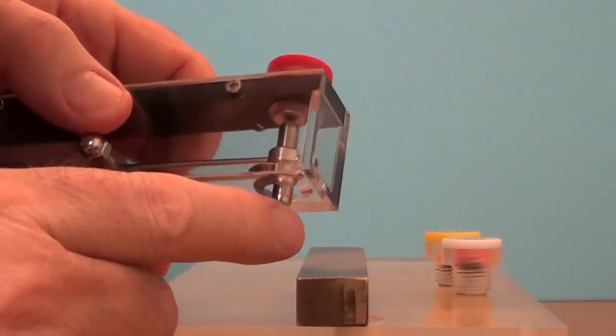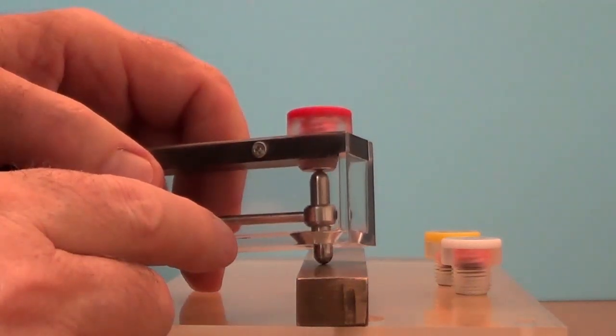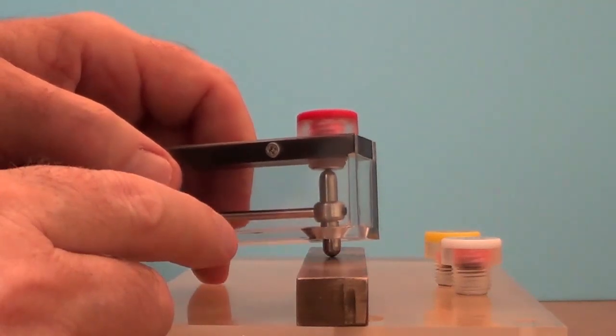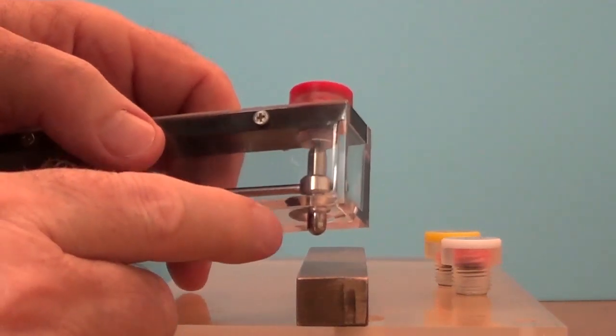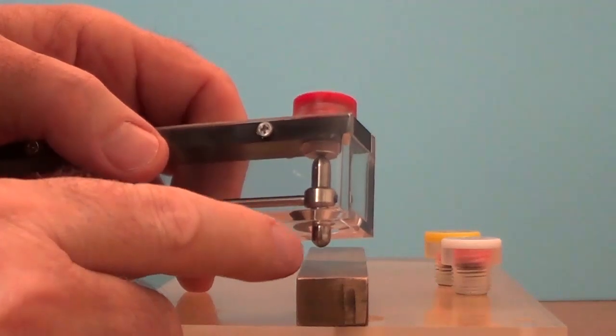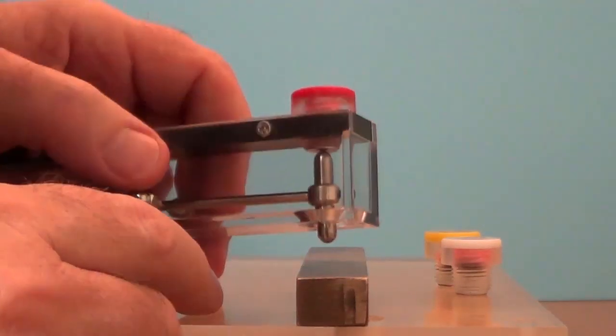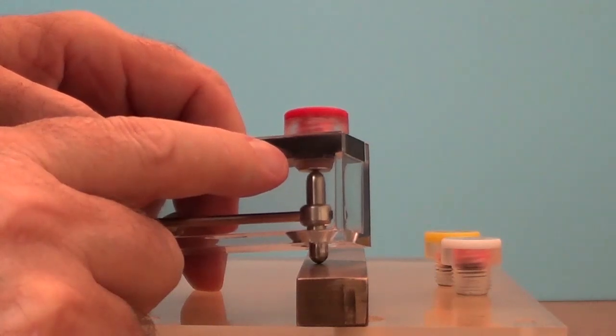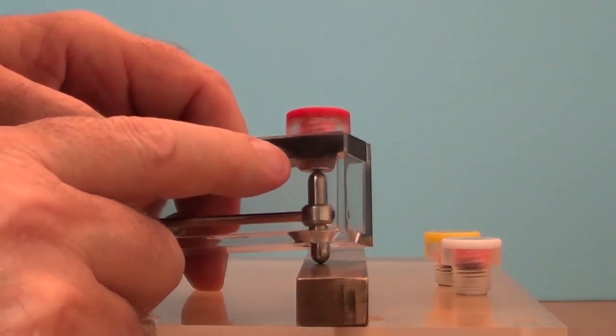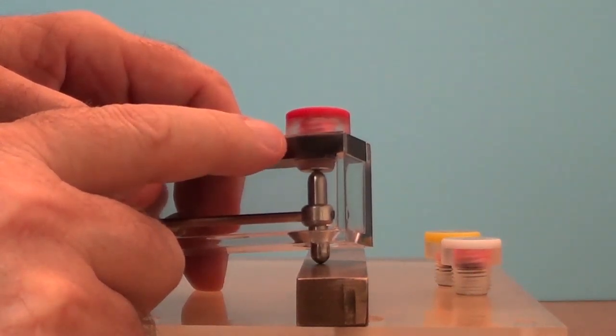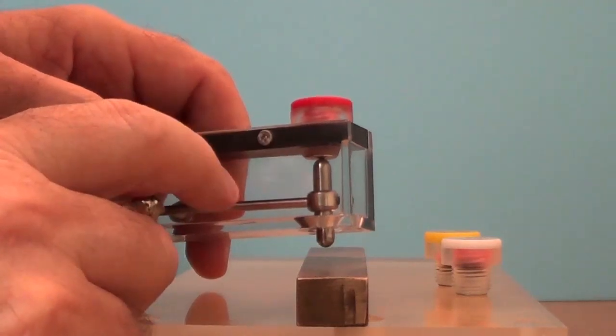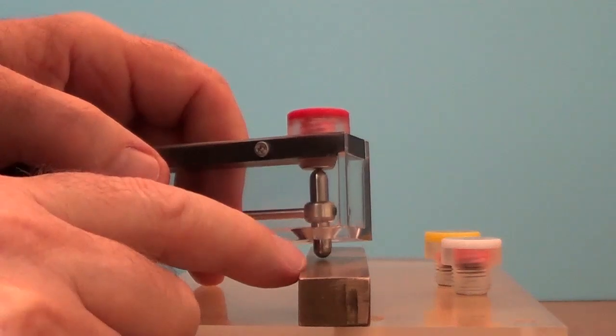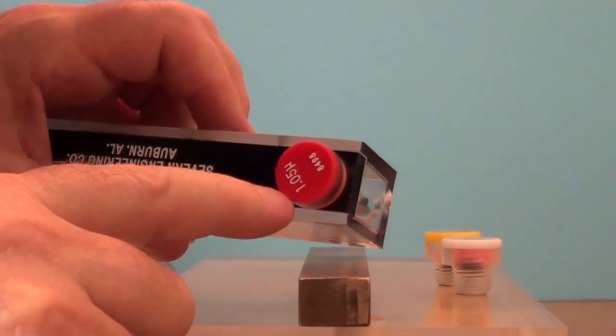Instead the end of the magnet that is in contact with the sample pulls away. So consequently the attractive force between the sample and my bar magnet is less than the attractive force between the other end of the bar magnet and the bottom of this insert. And that means that the magnetic permeability of this sample is less than 1.05.